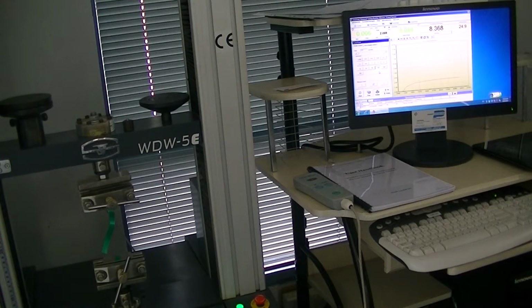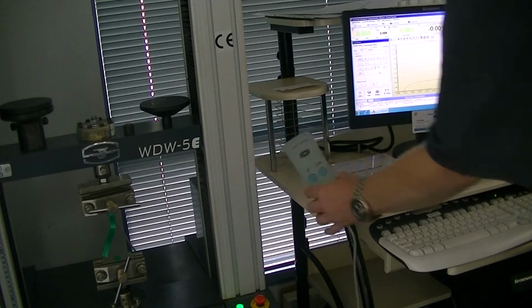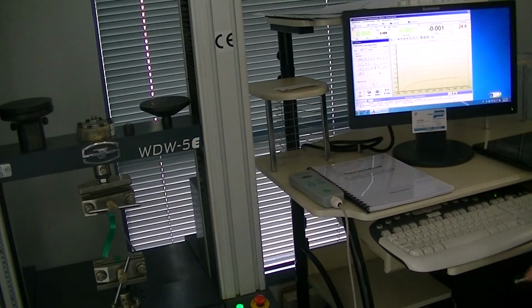So you can see here it's returning to the start position, and it's in the start position ready for you to put your next test. Again, you'll see that I haven't had to touch the up and down or anything. It's all automatic. So back to where we were. After testing complete, to view, analyze, click data process. So we click data process.